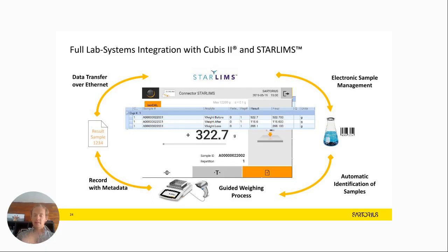That mostly finalizes my data integrity training. I wanted to explain what it means and why it is important, especially now in these uncertain times which we have. It will increase. We see over the last 2 or 3 months that, let's say for vaccine production, the FDA is pretty generous right now, but for everything else, the rules are pretty high. And it will be higher in the next years. I think that is pretty logical. Then I wanted to give some examples of what this means in your daily lab life and how we plan to implement the whole backup and connectivity part with our instruments in the future.